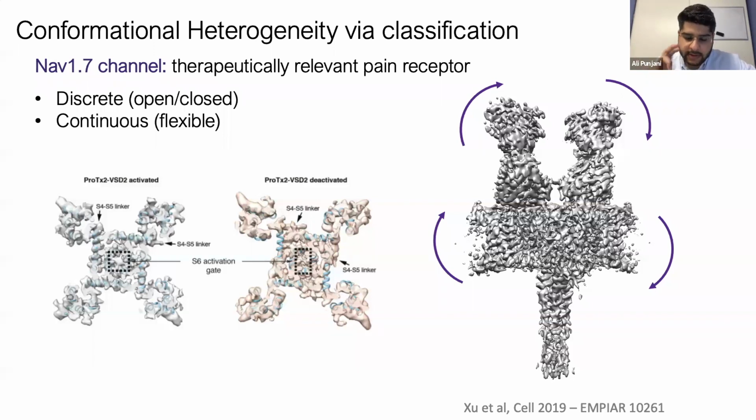3D variability analysis is computationally heavy. It's actually quite fast relative to how much work it's doing, but it does take probably a couple hours or a few hours on a large data set on a single GPU. And so we don't want to run it over and over again, but with the same results out of one 3D variability analysis run, you can do different actions to create outputs. So the display job has simple mode, cluster mode, and intermediate mode.